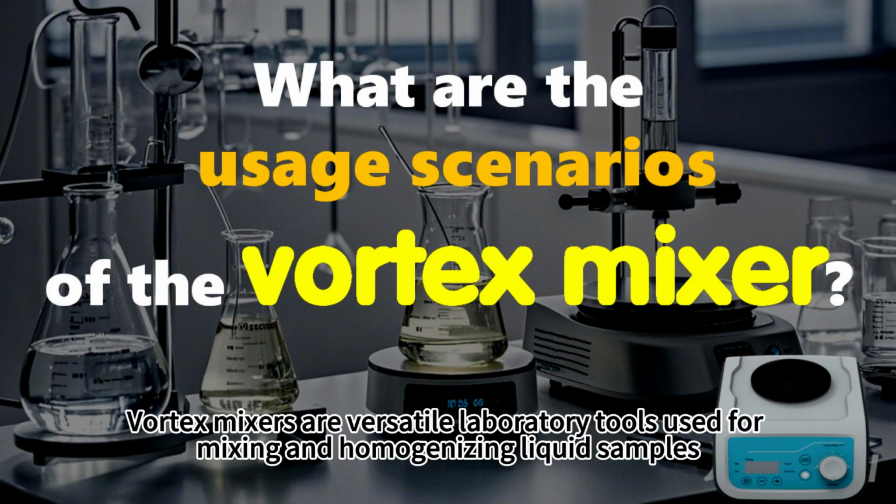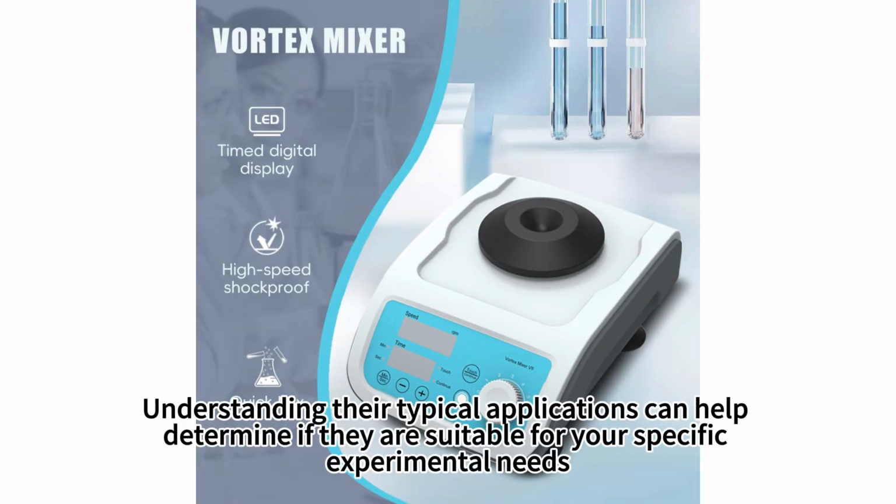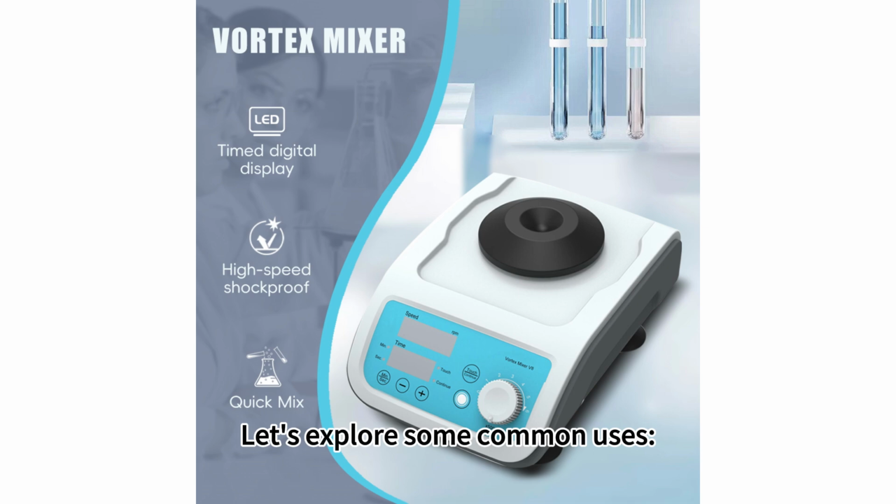Vortex mixers are versatile laboratory tools used for mixing and homogenizing liquid samples. Understanding their typical applications can help determine if they are suitable for your specific experimental needs. Let's explore some common uses.